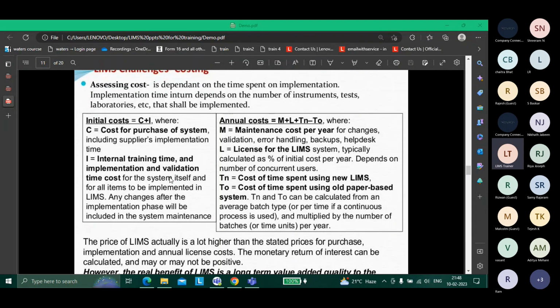That takes time and costs money. Someone needs to train them. Time is money. While assessing, it's not just buying it; how easy it is to teach the analysts how the UI is and how things are built are things to take into account while setting up the LIMS.